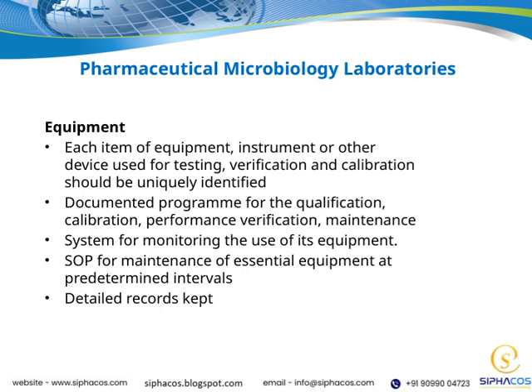In the context of pharmaceutical microbiology laboratories, these practices are fundamental. They help maintain the integrity of our testing processes, ensure data accuracy, and ultimately protect product quality and patient safety. So overall, effective equipment management is a cornerstone of a compliant, reliable microbiology lab. It ties into the larger theme of quality assurance and regulatory compliance that runs throughout our entire operation.